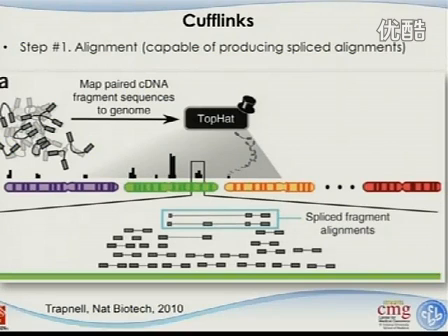You can see that there are some of the reads. And this is paired-end. So basically, you sequence both ends of a transcript. And for one connection, if you're seeing from the back, you probably won't see it, but look at your notes. If it's a solid line connected, that means that is one fragment, and you have two ends sequenced.